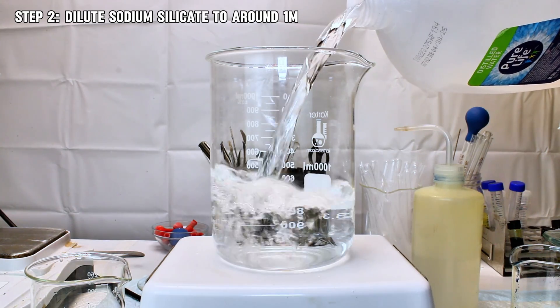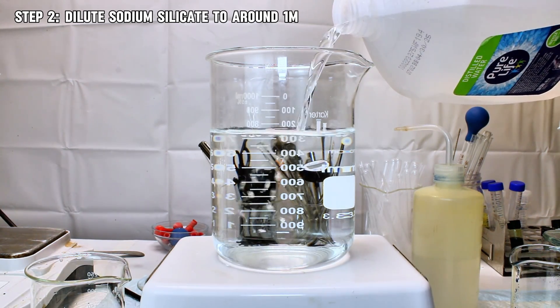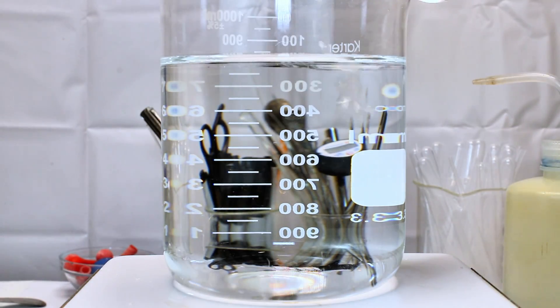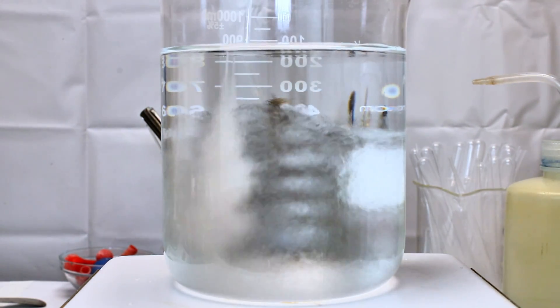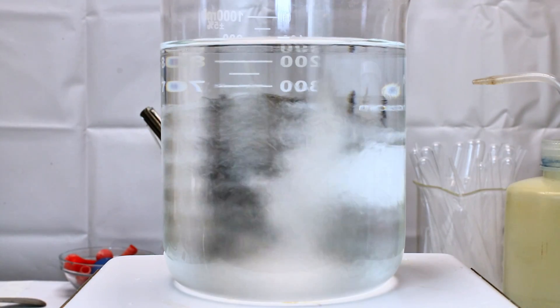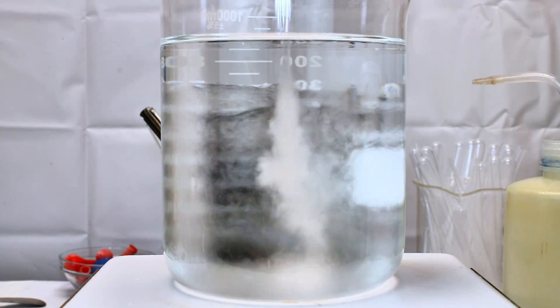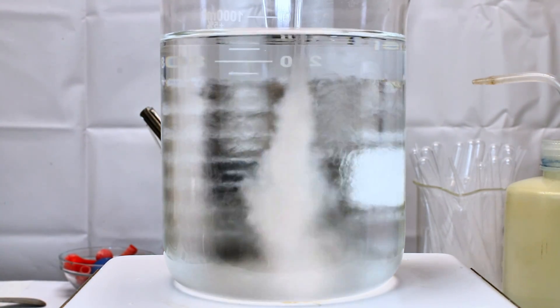This was then poured into 800 milliliters of water to dilute it to an appropriate concentration for this reaction, which gave a very cool effect due to the huge density difference between the two liquids. Once the solution was thoroughly mixed, the hard part was done, and it was time to grow my chemical garden.